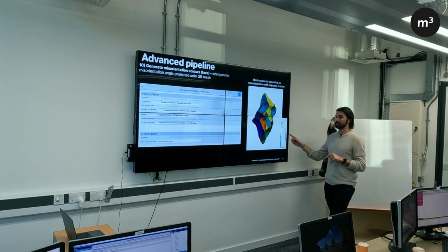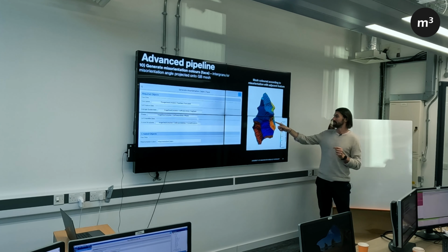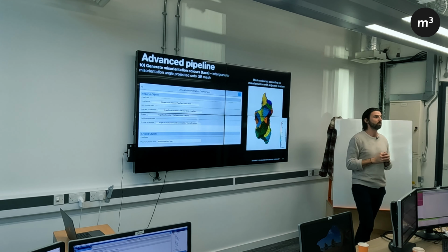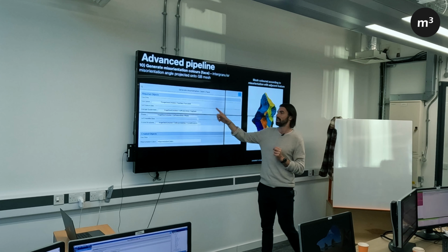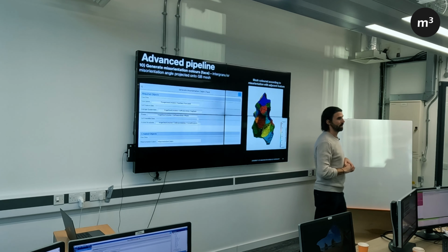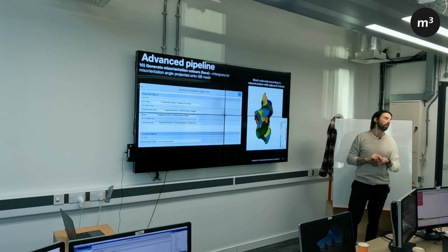You can then plot the misorientation, which is the example I showed right at the start. This is that single recrystallized Zirc grain, with each boundary colored according to the misorientation with the adjacent grain. You can see here it's taking our face labels, our orientations of each feature, and crystal structure, and calculating the misorientation for each boundary, and then we're coloring that onto the mesh.